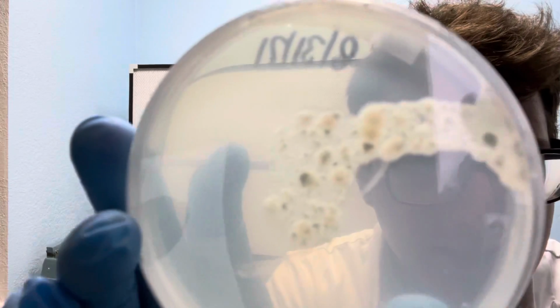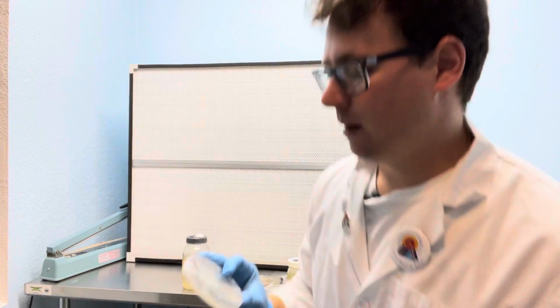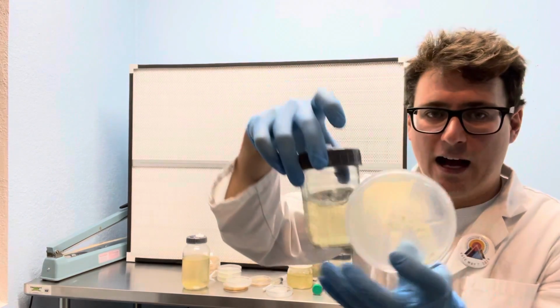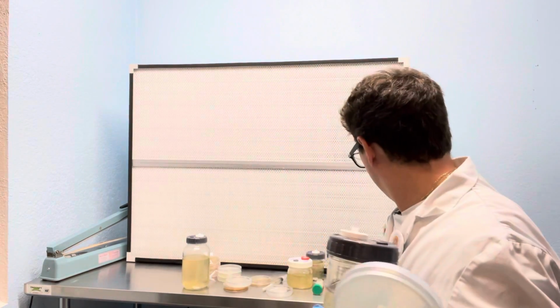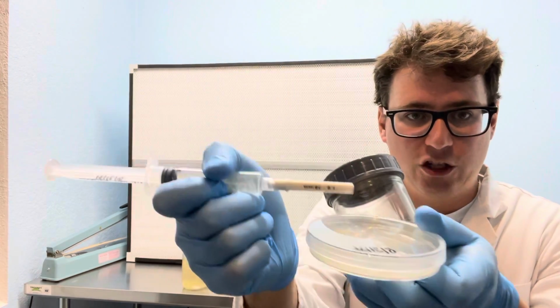Trichoderma typically shows up within 48 to 72 hours, and you can see the green spots right here, which are an indication of a mold called Trichoderma. So this would mean that this culture here, which I essentially just pulled out a solution of with a sterile syringe, injected onto this petri dish, and then waited to observe for healthy growth.